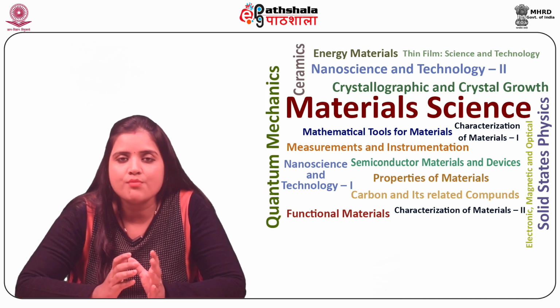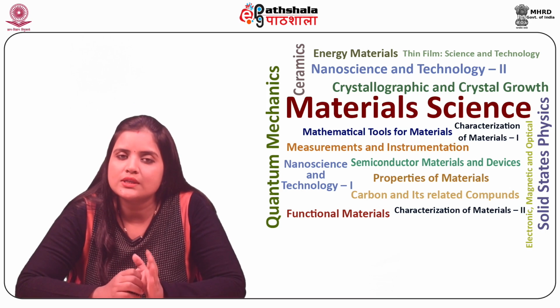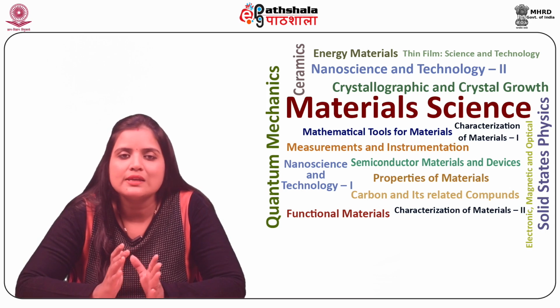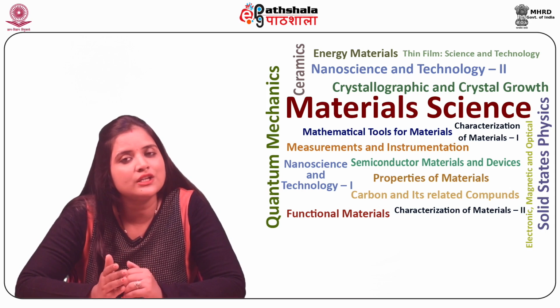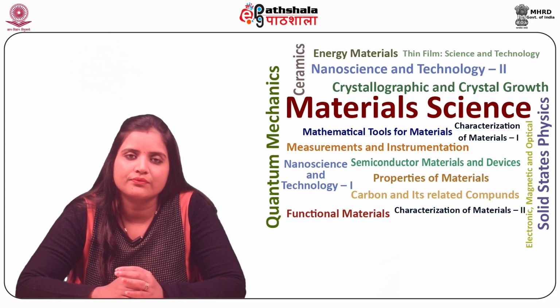Almost all modern microscopes include facilities to insert standard templates that are reproduced simultaneously with the sample, thereby leading to rapid and easy comparisons.